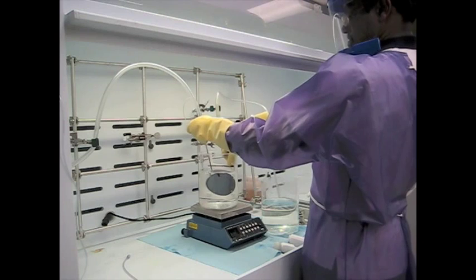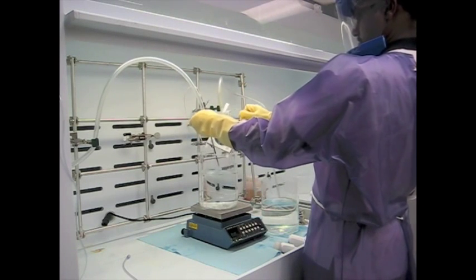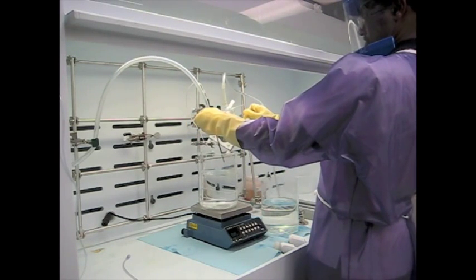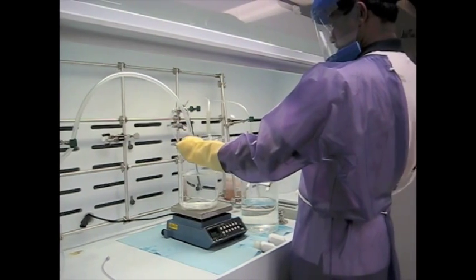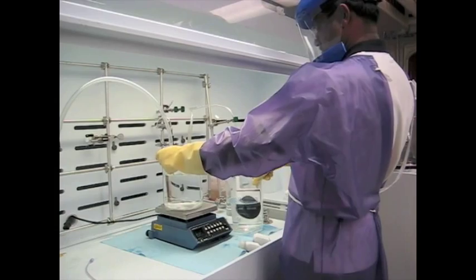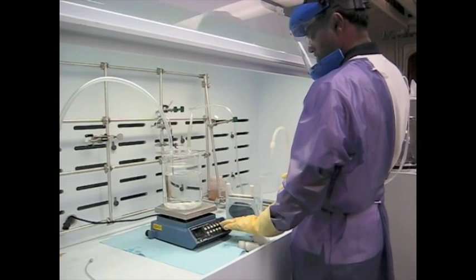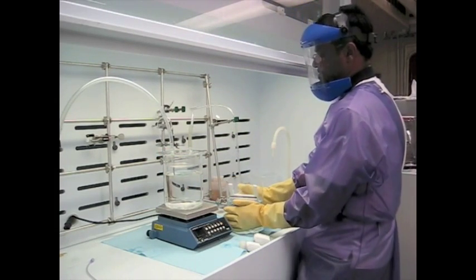After rinsing the wafer in DI water, the oxide layer is stripped off using BOE. The next step is to bond the wafer to a glass substrate, enclosing the etched microchannels. An anodic bonding setup is designed for this purpose.